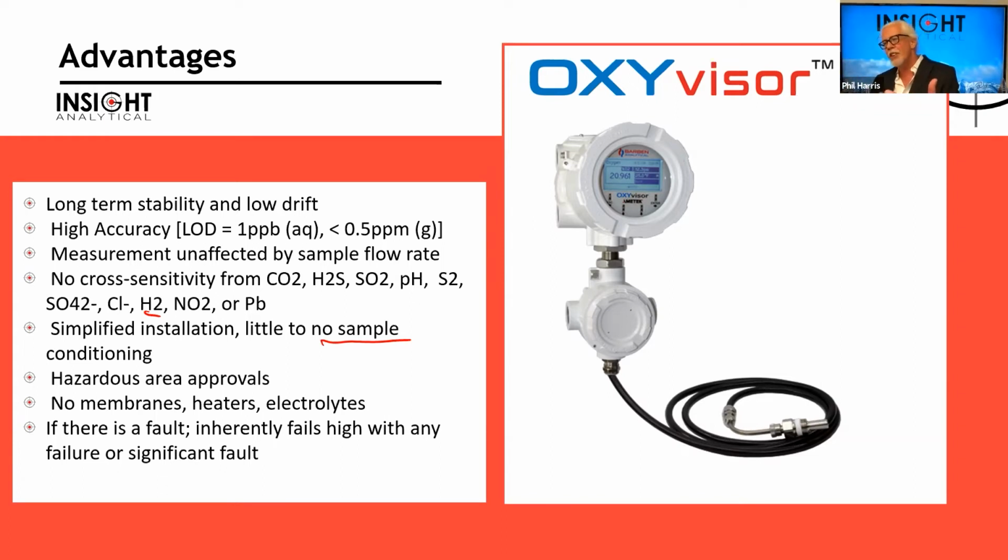A lot of oxygen analyzers, if they get exposed to air and get saturated, take a long time to respond again. So the interesting thing with this demo is you put the probe in something like a Teflon ferrule. So you can just loosen the ferrule a bit, pull the probe out, expose it to air. Analyzer's pegged. It's at 209,000 parts per million, or 20.9%. Put it back into the T, and within a minute, you can be right back down to reading 100 ppm again.